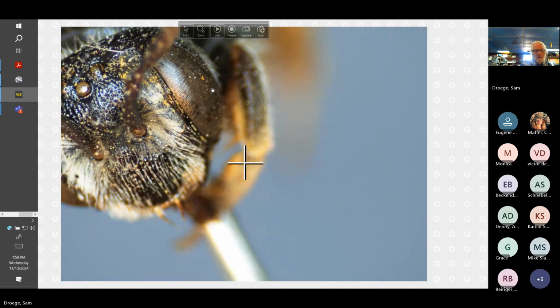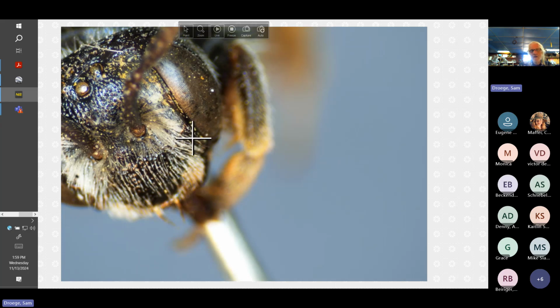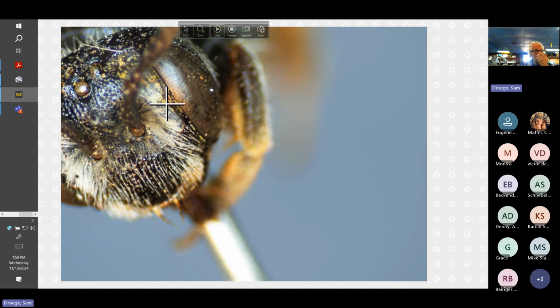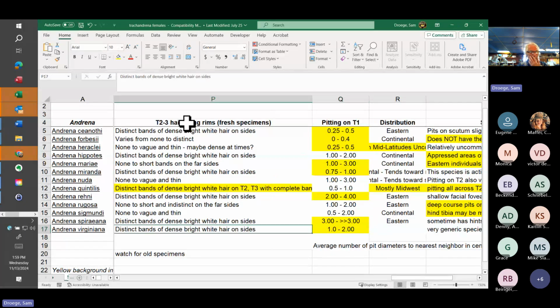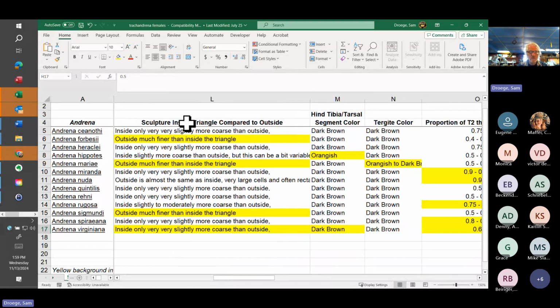So here is the upper part, here is the lower part. The lower part would appear certainly wider than many of the others, and the upper part isn't extreme. So yeah, I think it's listed as 2, something like that. Let's go back. So again, this sort of middle of the road sort of thing.